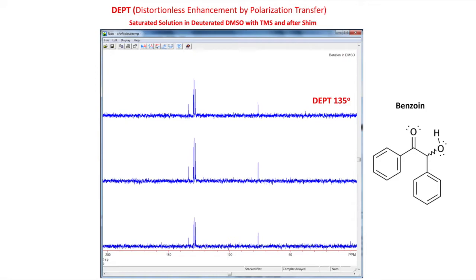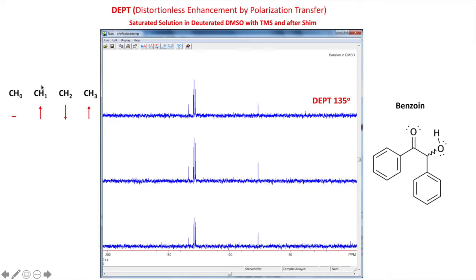This first spectrum on top is the DEPT-135. It does not show signals for carbons that have no hydrogens — CH0, no signal. If a carbon has one hydrogen, the signal points upward. If it has two hydrogens, it points downward. If it has three hydrogens, the signal points upward again. So odd numbers of hydrogens point up, CH2 points down, and CH0 shows nothing. We have no CH2s here because there are no peaks pointing downward. Looking at the benzoin molecule, every carbon is either CH0 or has one hydrogen — no CH2s anywhere. So this confirms it.